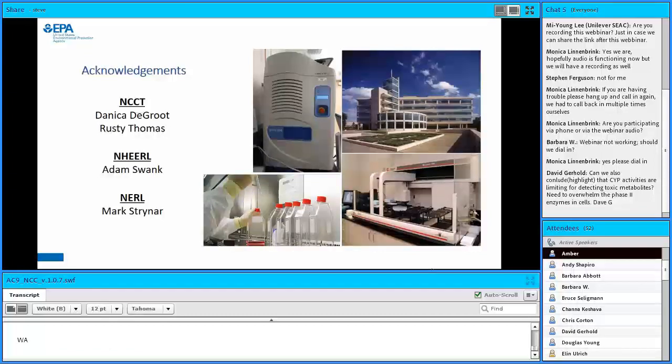So you can imagine a scenario, though, where you're making reactive metabolites, and if given time, they're cleaned up. But if you're catching them in real time, you can measure things like, say, NRF2 activation, right? So I wouldn't necessarily say that we have to overwhelm every cellular defense to see them.